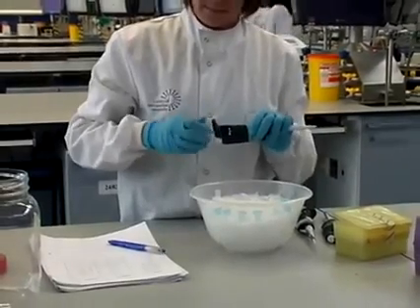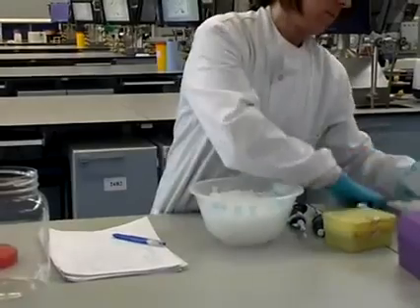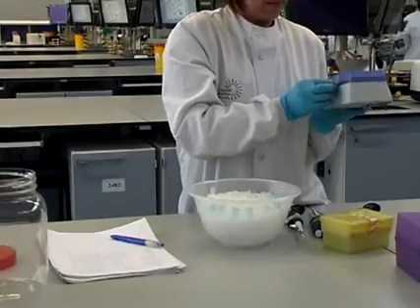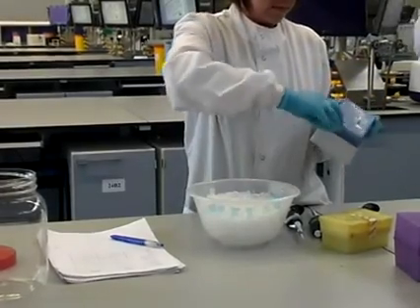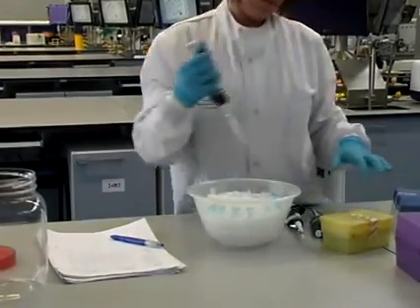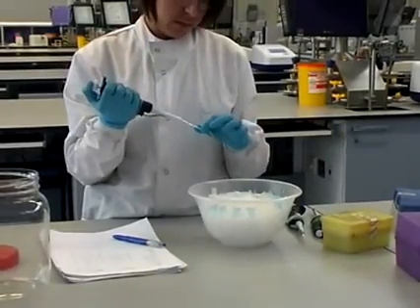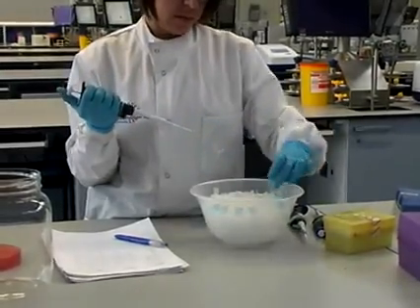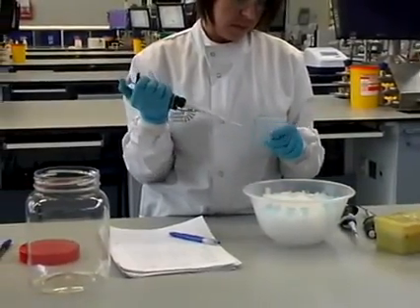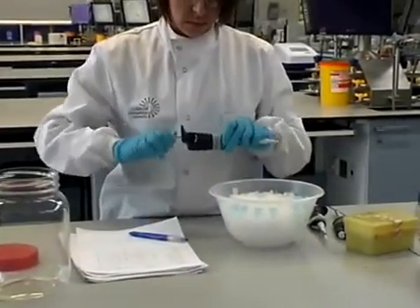Pipettes are used to ensure that you get the correct volume of each reagent. As you add the reagent to your master mix you tick off your working list to make sure you've added your reagent and that you don't add double the volume required. Magnesium chloride helps the enzyme to anneal to the DNA strand. The enzyme used is Taq polymerase, which is added at the end.